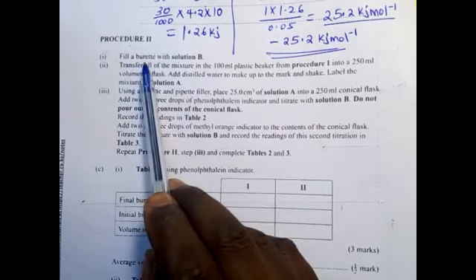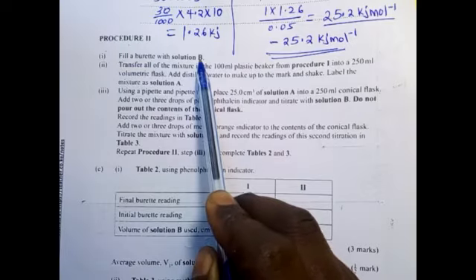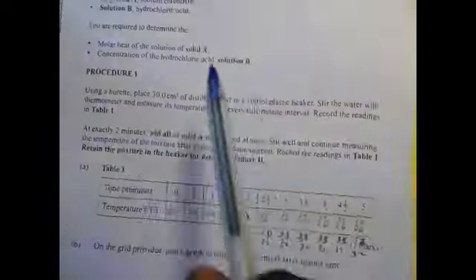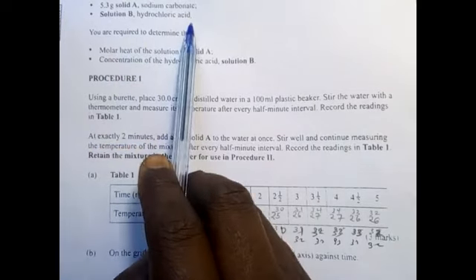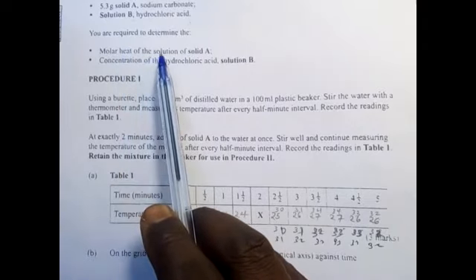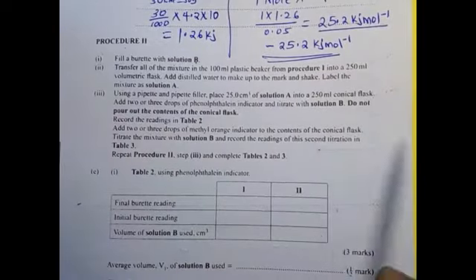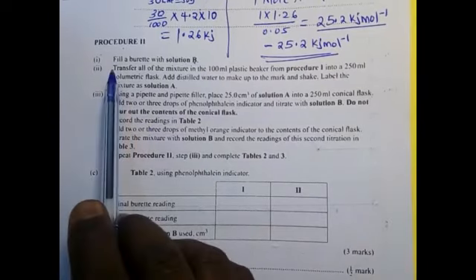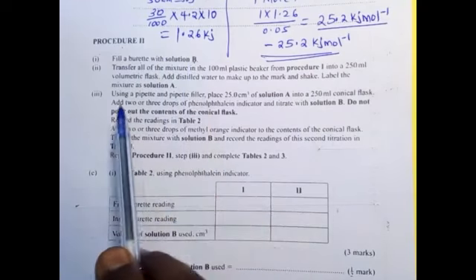Fill a burette with solution B. You should always remember, what was solution B? Solution B is hydrochloric acid. These are the pieces of information which you must put at the back of your mind as you continue to go ahead. So fill the burette. In the burette, we are going to have HCl, solution B.